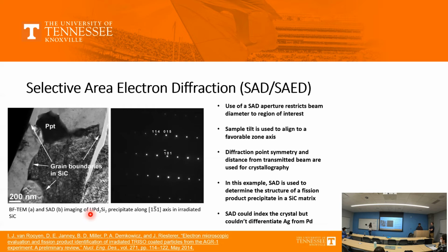A little bit like, why are you getting more background at higher density? Intuitively I would expect to get more signal. When I say background, I mean matrix. You're not getting digital noise, you're getting matrix information. Think of a magnifying glass: you're creating a super high intensity spot, so you're putting a lot of electrons through that. So you're exciting a larger interaction volume.